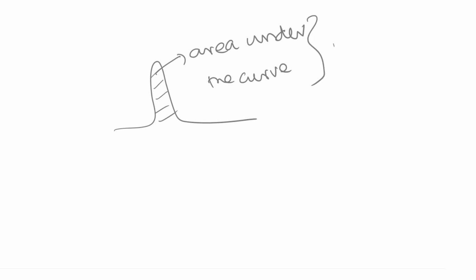In mathematics, the area under the curve is very important, and the area under the curve can be determined by integration. Again, I will not go into too many details, but this area under the curve is useful when you want to quantify.